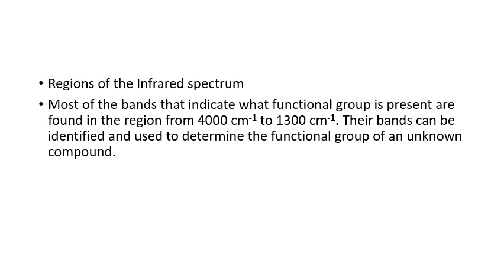Single, double and triple bonds give different peaks. So this can be verified here. Similarly, this can be checked for CC bonds, CH bonds and so on.